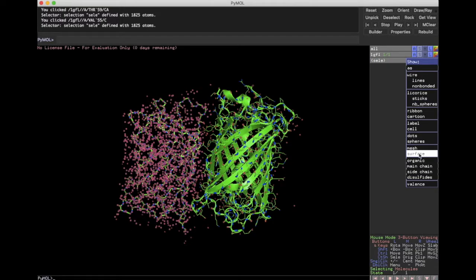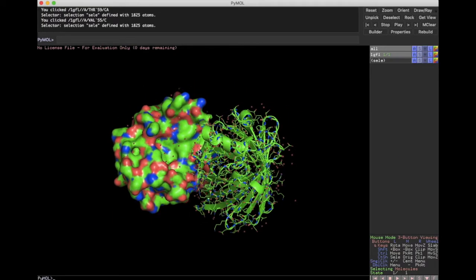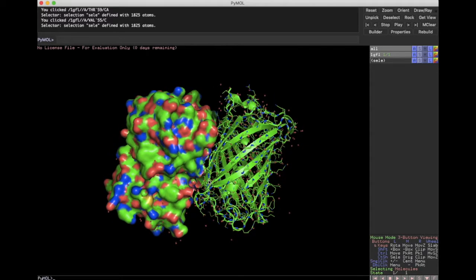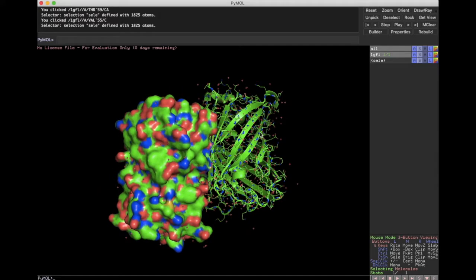You can actually compute the surface of that protein. Okay, so I'm going to deselect now. And imagine all of the amino acid side chains and everything. Imagine the van der Waals spheres where it's kind of like the edge of each one of the atoms. This would sort of be the surface of the protein. Okay, so that's a pretty neat one.